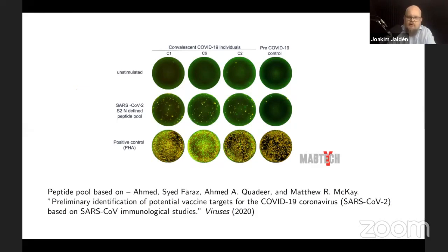So the company that we worked with developing these methods picked up on this paper quite early, and just a few months later, they actually had products out. So you can buy these plates pre-coated with the correct antibodies to test these vaccine targets. And if you do that, you would obviously need access to both the hardware and the software that I've been talking about today.